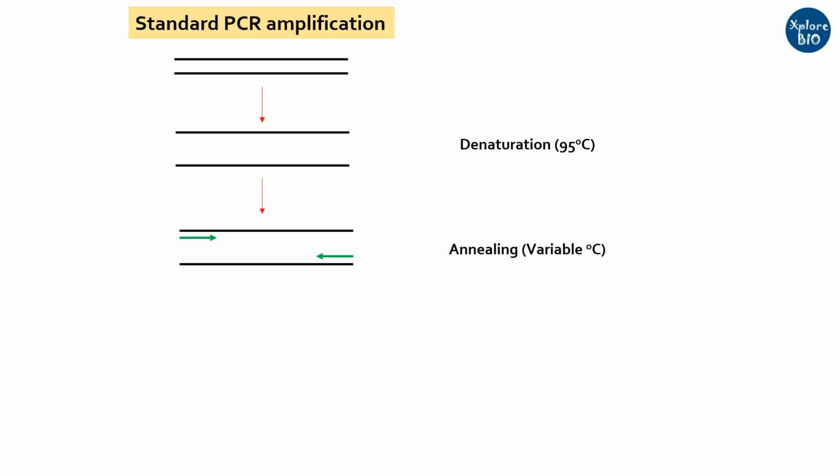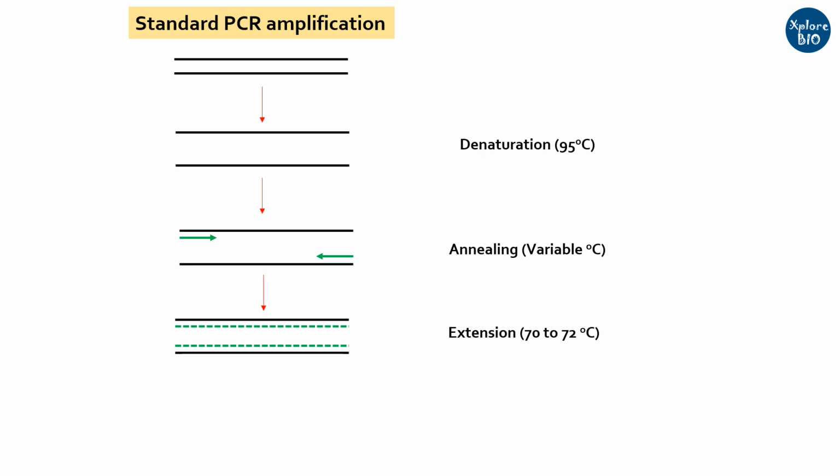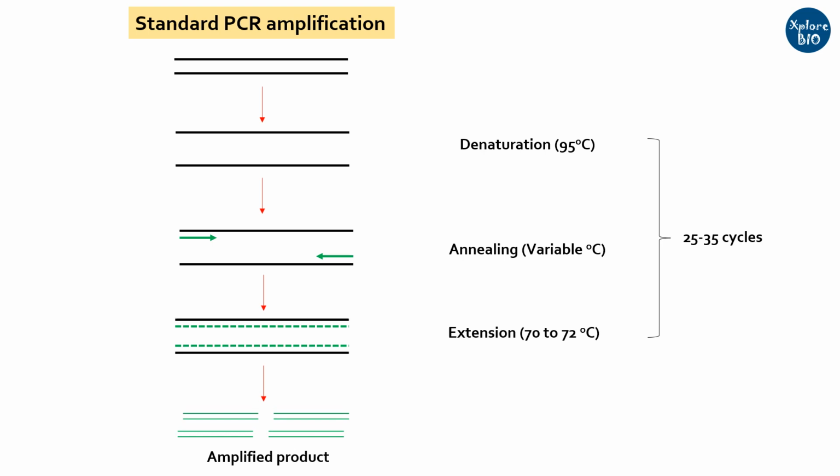In the next step, the temperature is increased to 70 or 72 degrees, where the DNA polymerase carries out the extension of complementary DNA strand. These three steps are repeated for about 25 to 35 cycles to create millions of copies of desired fragment. This is termed as PCR amplification. This is followed by a final extension for a longer duration, depending upon the amplicon size, to complete the synthesis of partially extended products, if there are any. Finally, the PCR reaction is stored at 4 degrees or minus 20 degrees for longer duration.